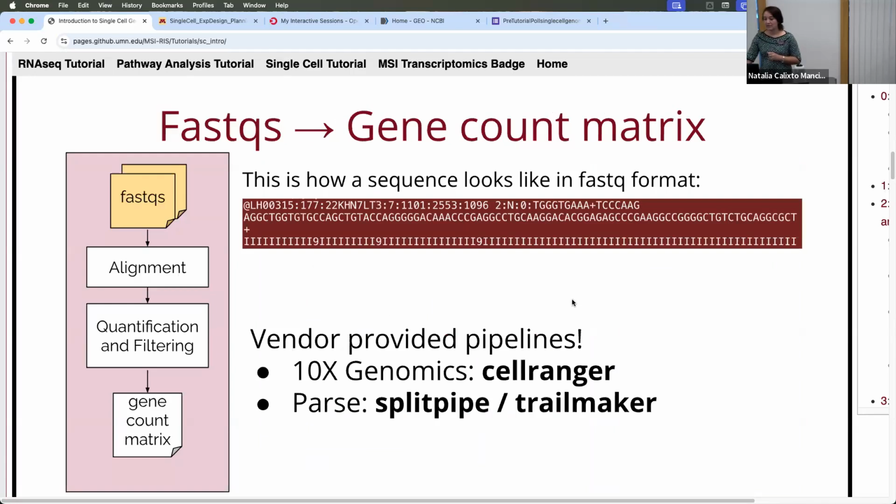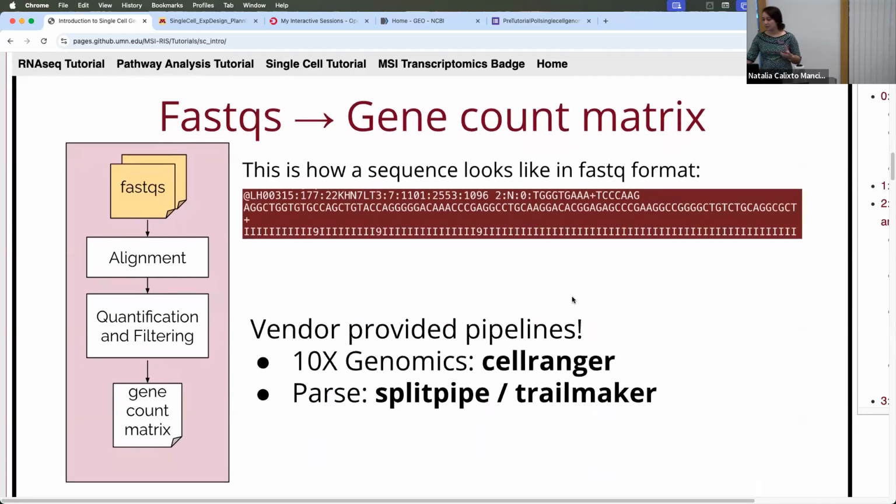Okay, so let's start with step 1, a little overview. What is this sequencing file thing? Maybe some of us are not familiar with this. So it turns out that a sequencing file that comes in a FASTQ format is basically a really big text file. And this text file has information of every single sequence that you got in your library. And it looks like this.